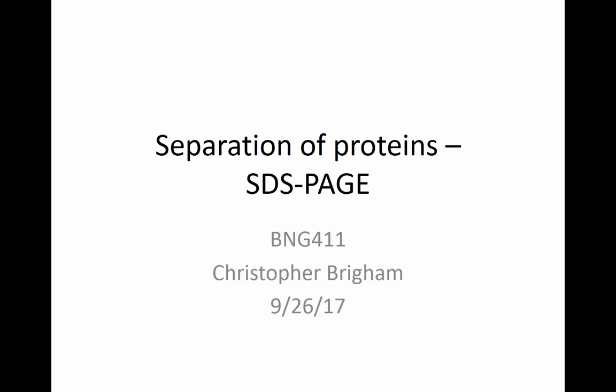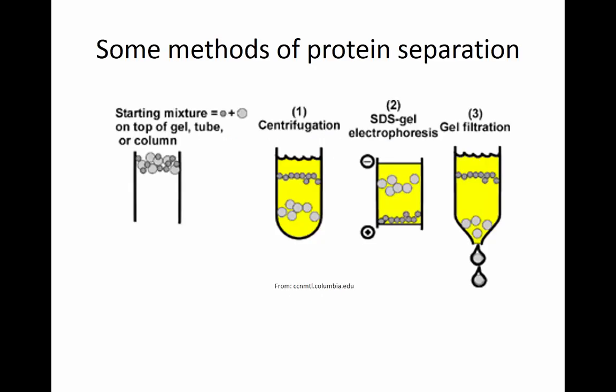Also, please note that if you are going sequentially in the lab manual, then you will see that up next in the lab manual is supposed to be enzyme assays. We're going to do those later on the lab schedule that is in the syllabus that you all have read. SDS-PAGE is what's next. So SDS-PAGE is the lab you will be doing this coming week, starting Tuesday the 26th.